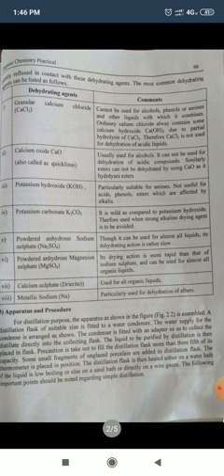Second is the drying of liquid. For drying purposes, liquids, especially organic liquids, are kept in contact with a suitable powdered dehydrating agent. Occasionally, the liquid can first be refluxed in contact with this dehydrating agent. The most common dehydrating agents can be listed as follows: the dehydrating reagent and comments.